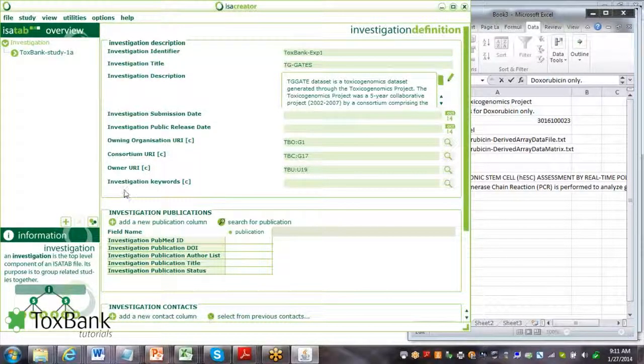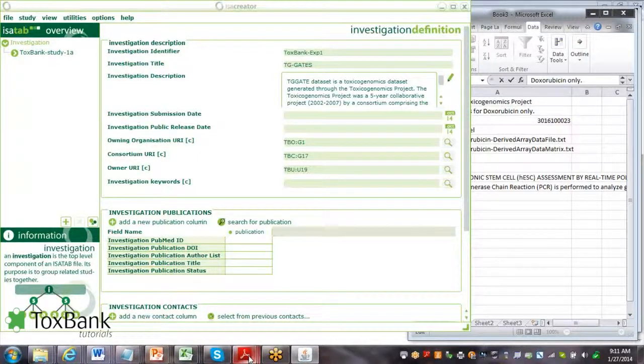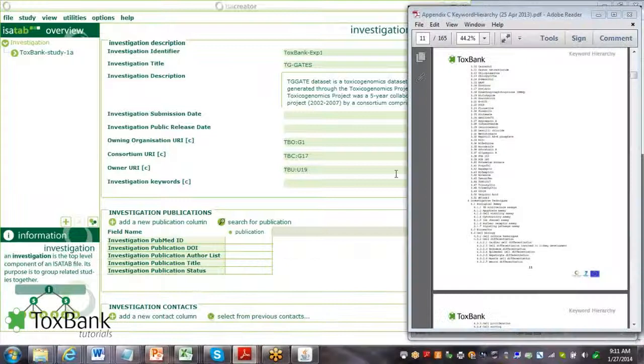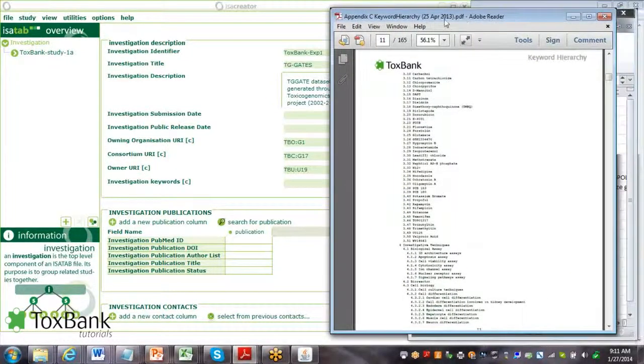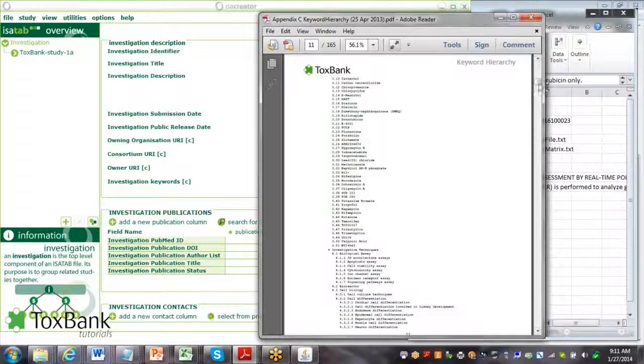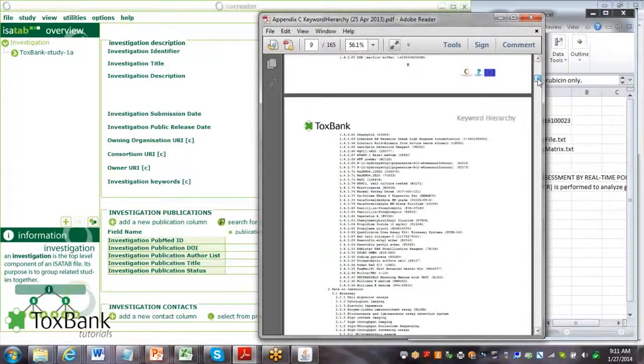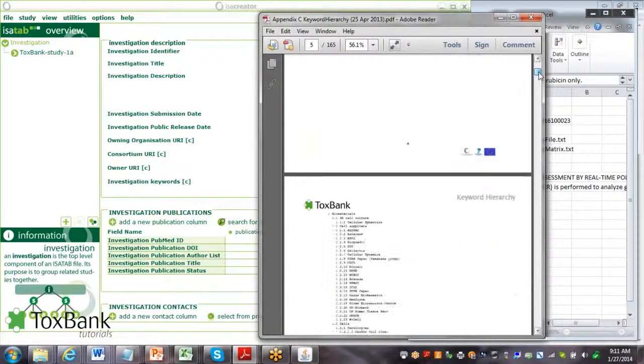The next step is filling in a number of keywords. There is a predefined keyword hierarchy, which you'll be able to access and look through. Generally, this keyword hierarchy is organized by - I'm just going to go to the top here.